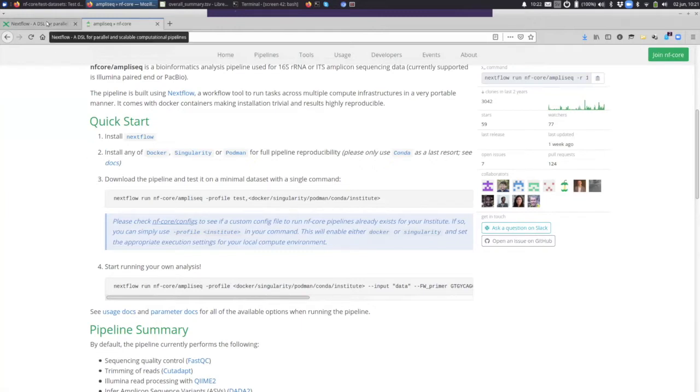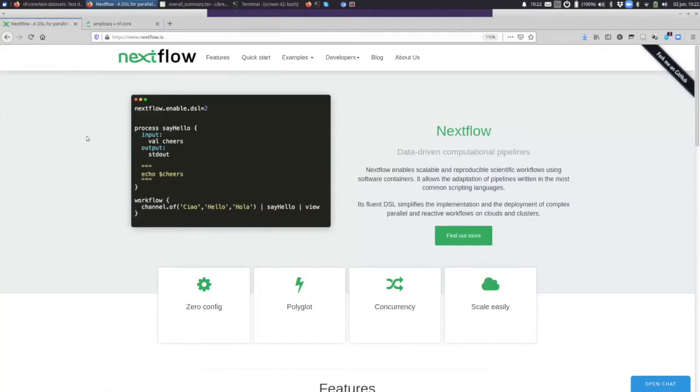So Nextflow is nextflow.io. It's a workflow manager, a very sophisticated one, in my opinion at least. So it can handle different computing environments. So you can run pipelines on your local computer, or you can run them on a cluster like at UPPMAX, or you can run things at Amazon cloud instances, and well, all sorts of architectures are supported out of the box. In addition to that, NF Core also has some institute-specific ways of running things. So UPPMAX is really well supported.